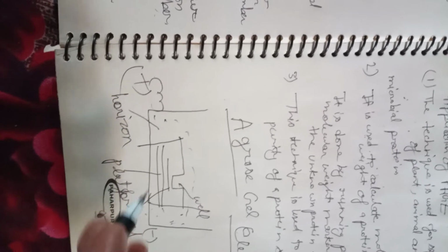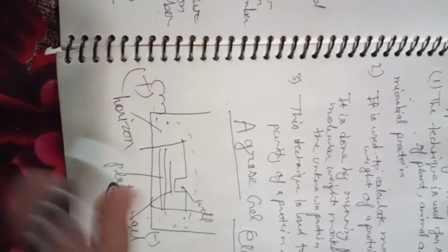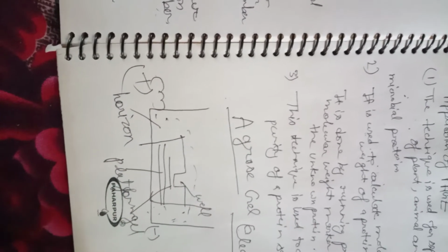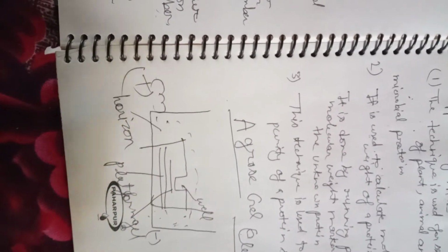The separation of DNA molecules occurs due to the different mobility of DNA molecules according to their size. Small DNA molecules can move freely inside the gel and large molecules move with difficulty. Since DNA molecules separate according to their size, the molecular weight of DNA can be calculated using DNA molecular weight markers.